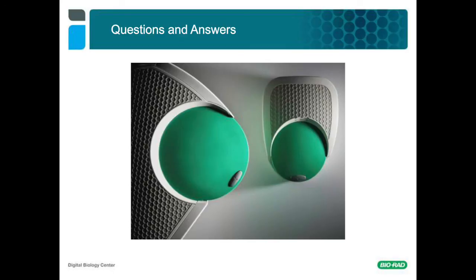Again, with CGH, you're going to likely lose any linkage measurement that is present just due to the way in which the technology works. I'm not sure exactly how you would do that. You would have to have two specific hybrid oligos to an array and look for binding across those two spots, which I think would be difficult, but maybe somebody who's more of an expert at CGH would have other insights that I'm not seeing at this point.